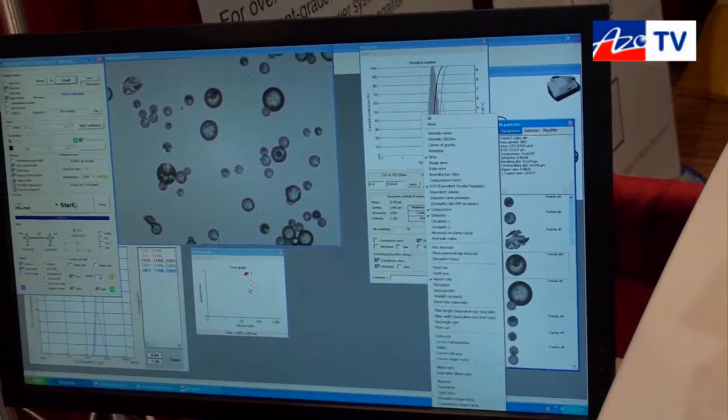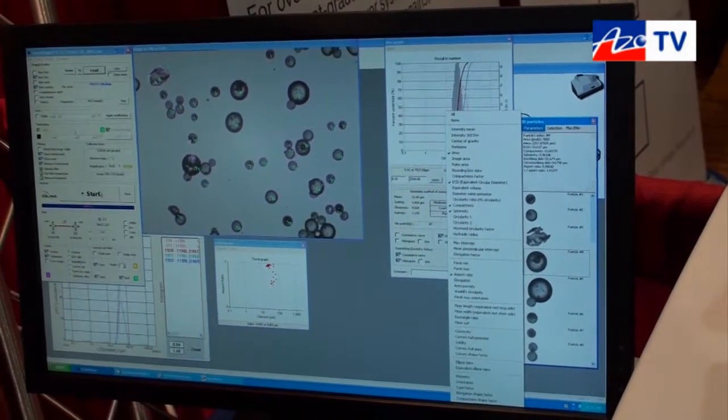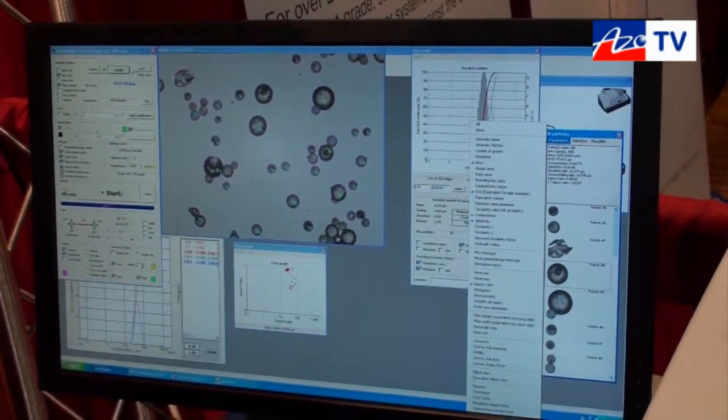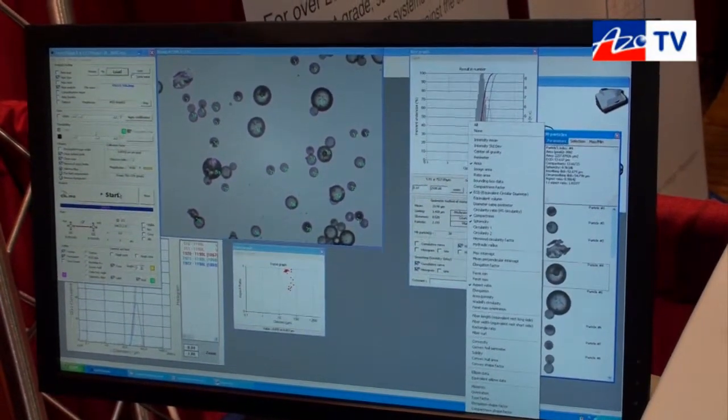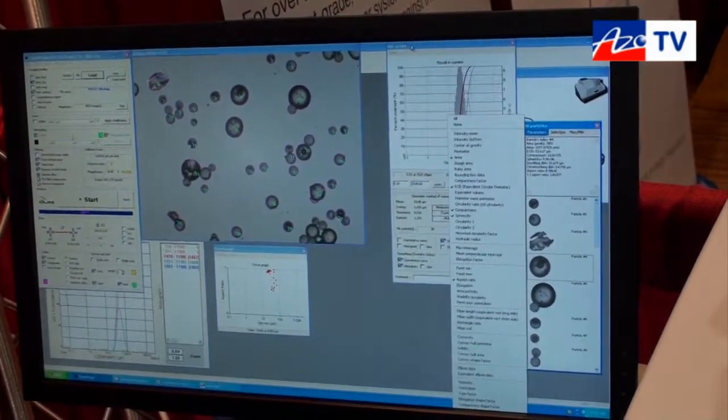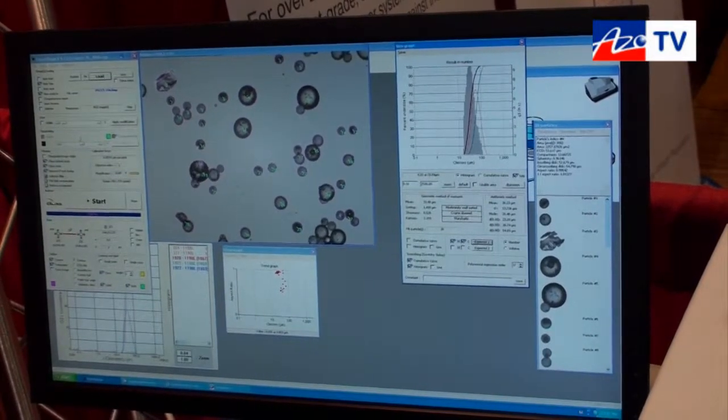We also have the ability to load in multiple images and that is only limited by the hard disk space or network space that you have. The higher the number of particles, the higher the matching capability of spherical or non-spherical particles would be to the particle size analyzer.